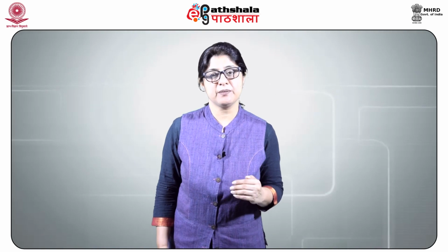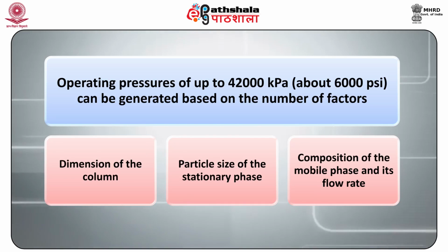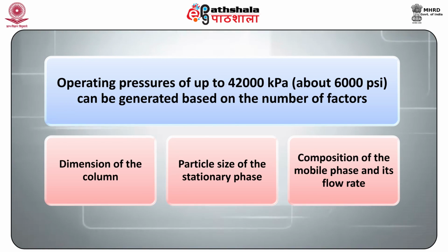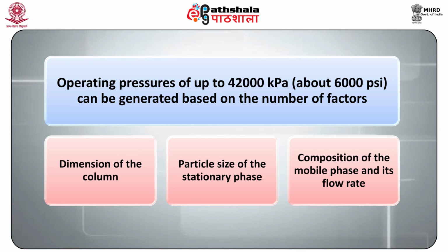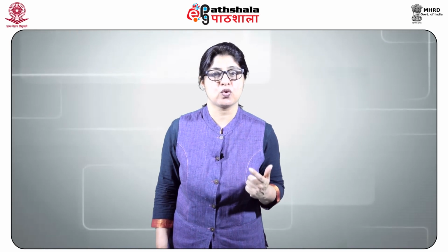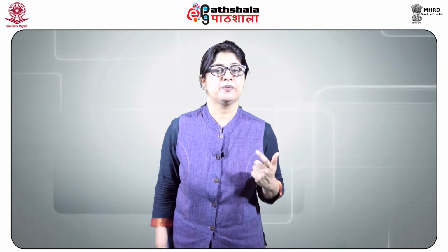Pump. A pump sucks the mobile phase from the solvent reservoir and pushes it through the column and a detector. Operating pressures of up to 42,000 kPa, which is about 6,000 psi, can be generated based on a number of factors that include the dimension of the column, particle size of the stationary phase, the composition of the mobile phase and its flow rate and so on. Microprocessor controlled pumping systems have the capability of precisely delivering a mobile phase of either constant isocratic elution or varying gradient elution composition according to a defined program.